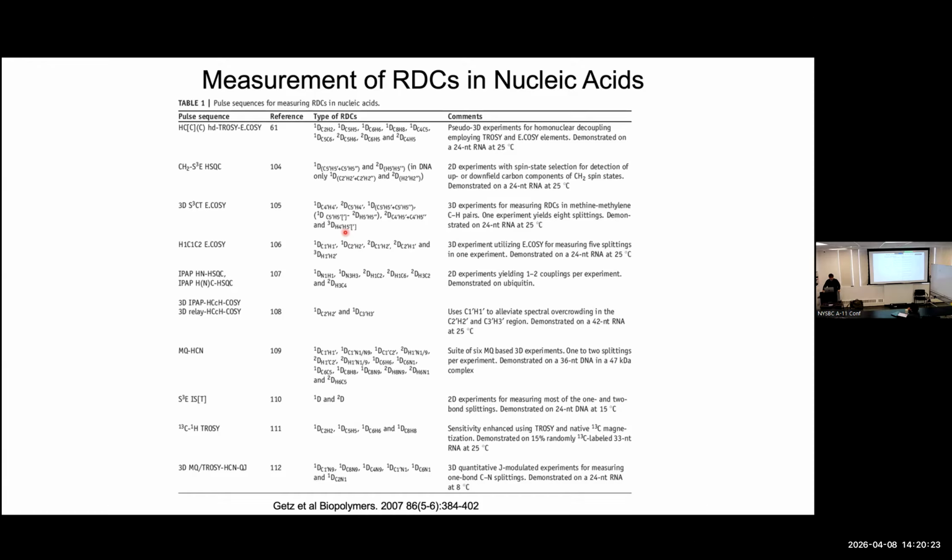So now let's imagine I do that, just for fun. I'm going to set my little delta to give me a cosine that's 1. So I set pi J delta to be 0. If I set pi J delta to be 0, I get 1 for that number, agree? And so when I measure my signal, I get a nice peak. Great. Okay, now I vary delta. I don't make pi J delta 0, I have a finite number because I'm in control of the delta.